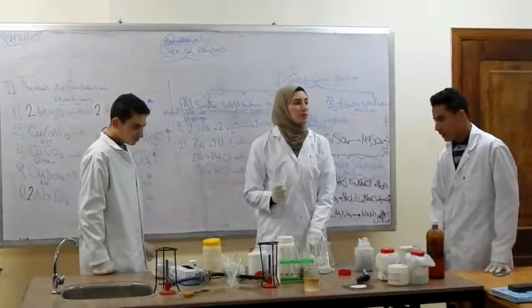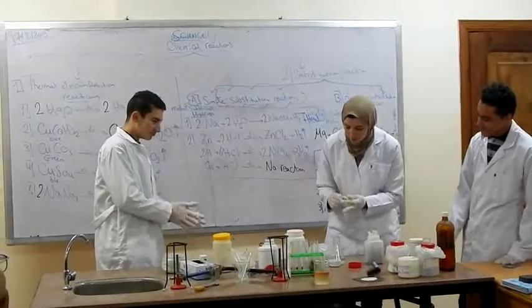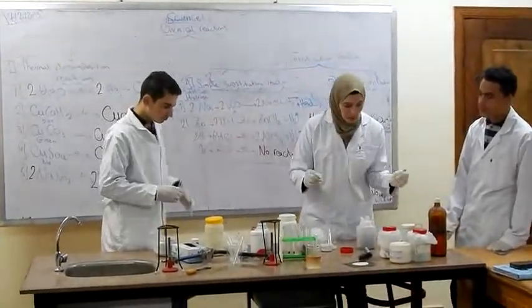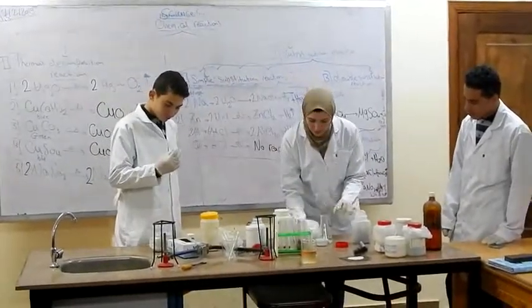What's the color of copper sulfate? Blue, yes. Copper sulfate has blue color. Okay, we have magnesium metal and a solution of copper sulfate.